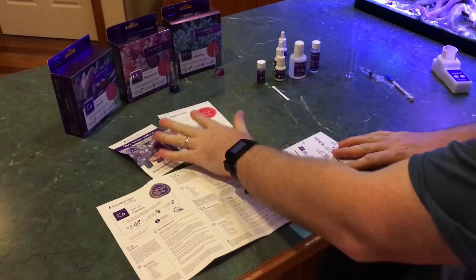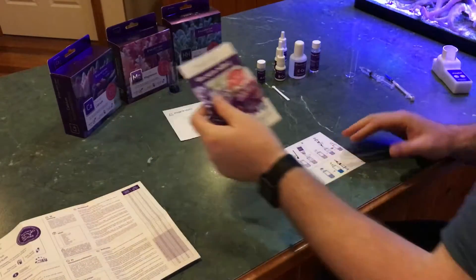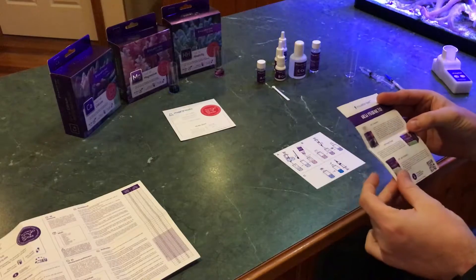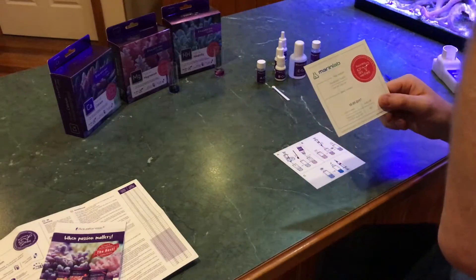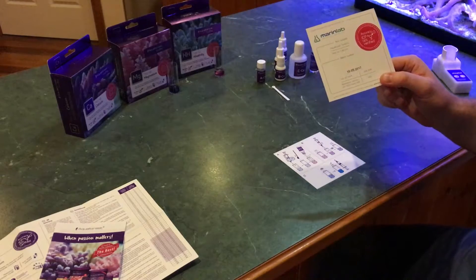Opening this box, you get a fair bit of stuff with it again — written instructions (I don't use them), advertising material. I've been drooling at these purple boxes too long so I know most of them, although interestingly there are a couple of things on there that aren't quite available here in Australia.